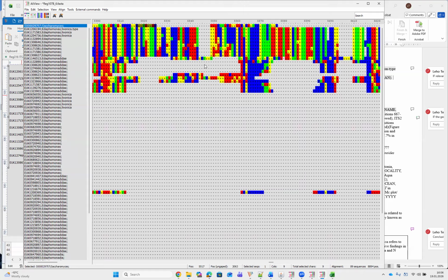So now it's also a question whether we want to display other members of the family here. So we can drag a few alignments here to bring them to the picture. Okay, here it's more part of the another.